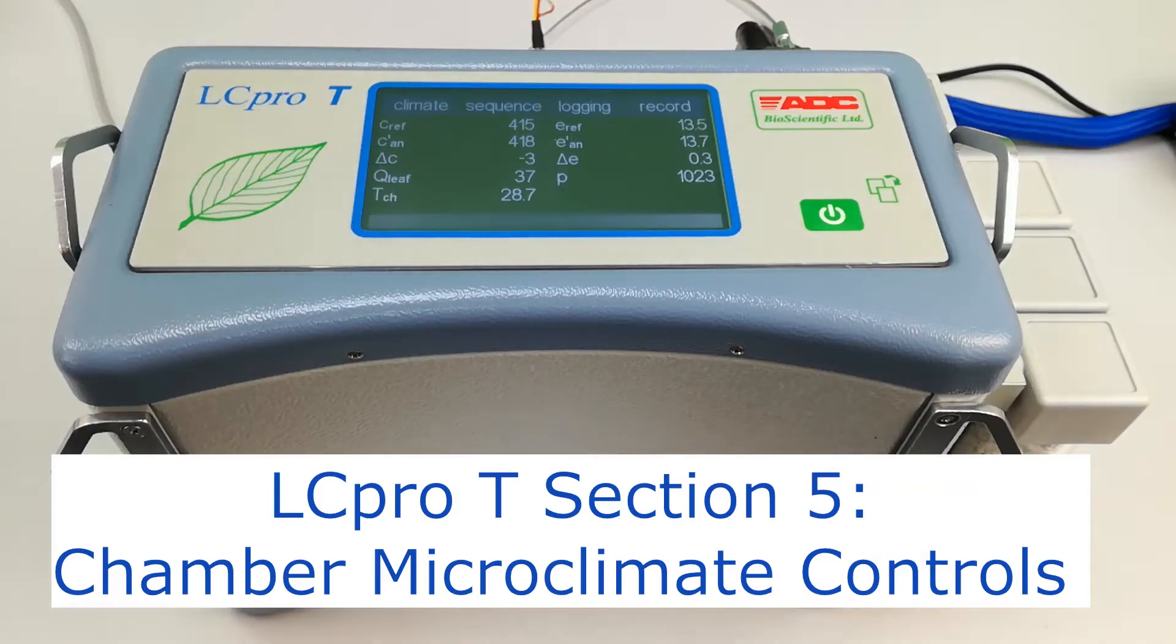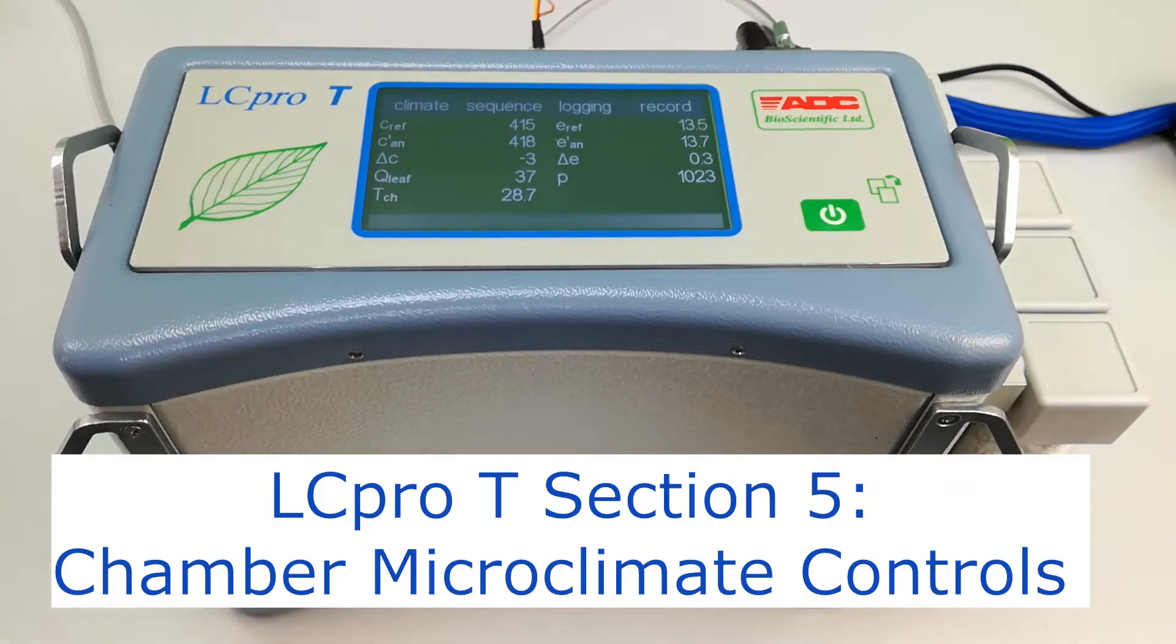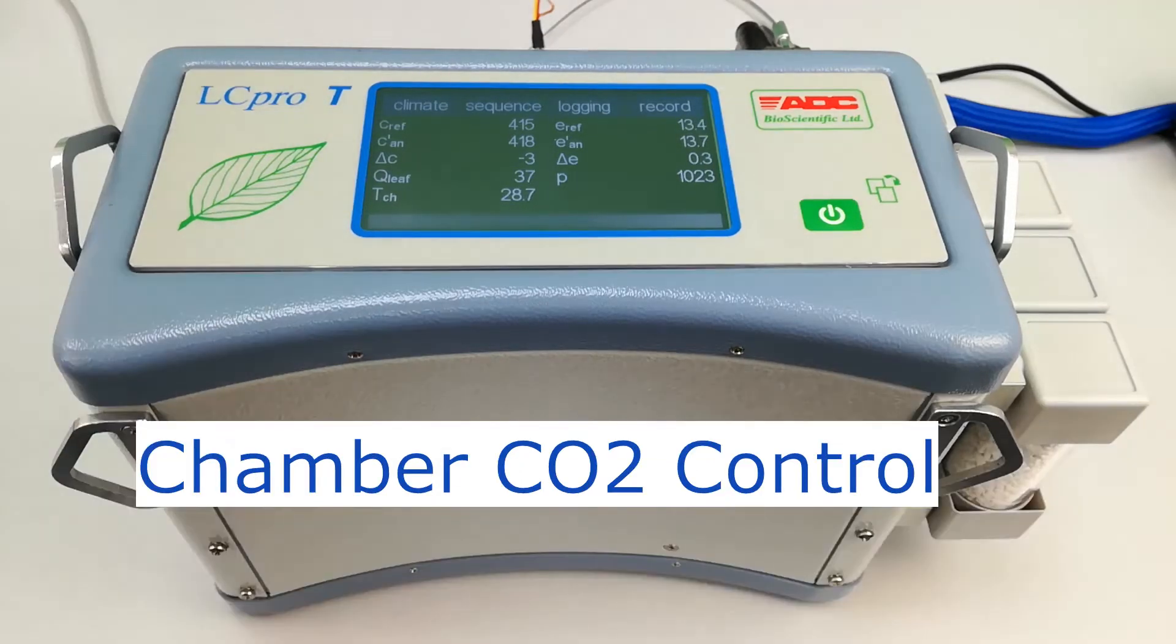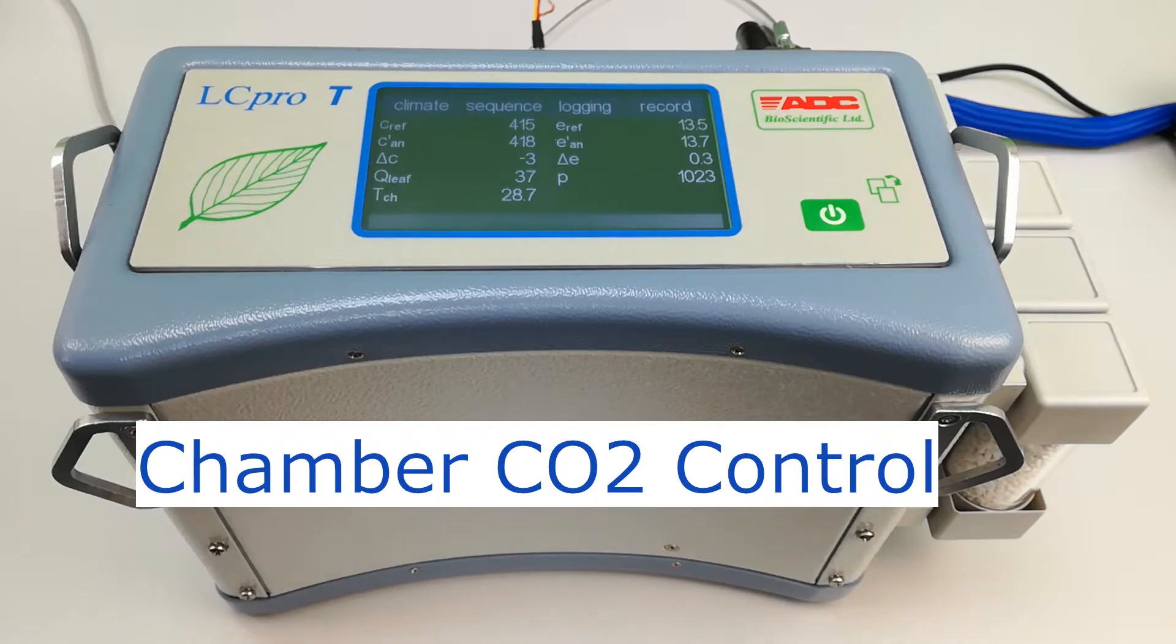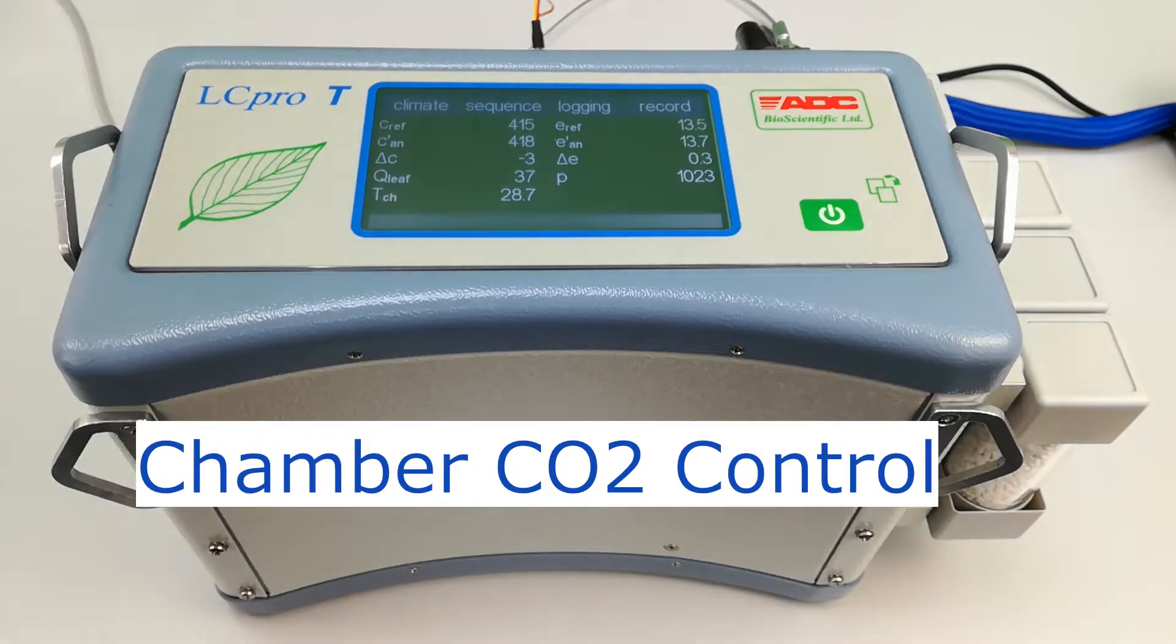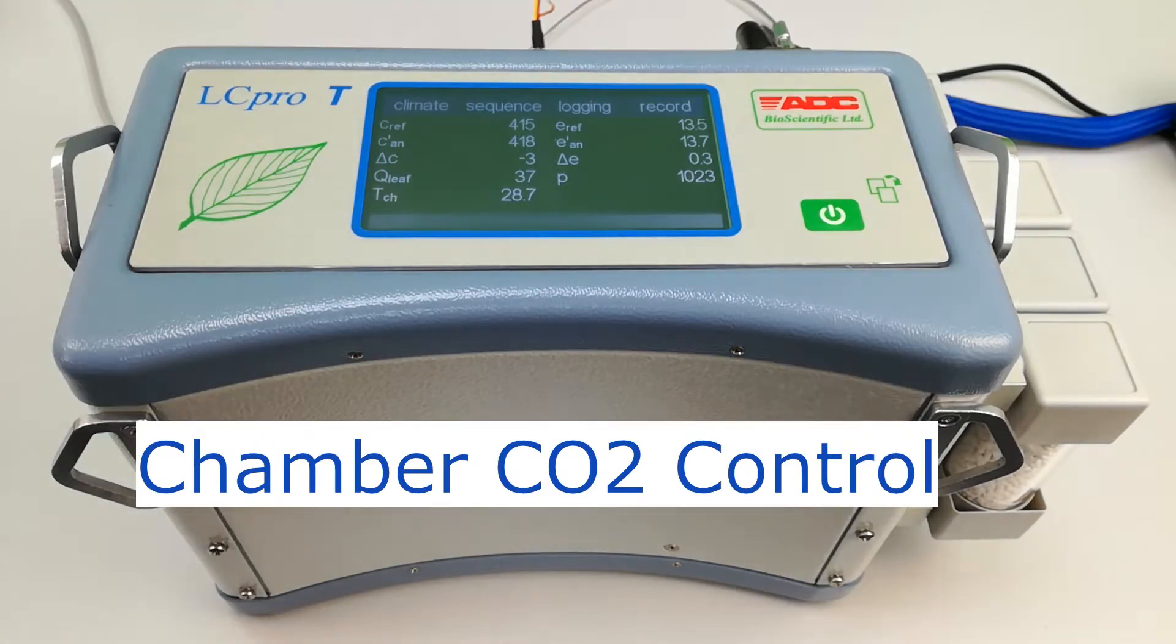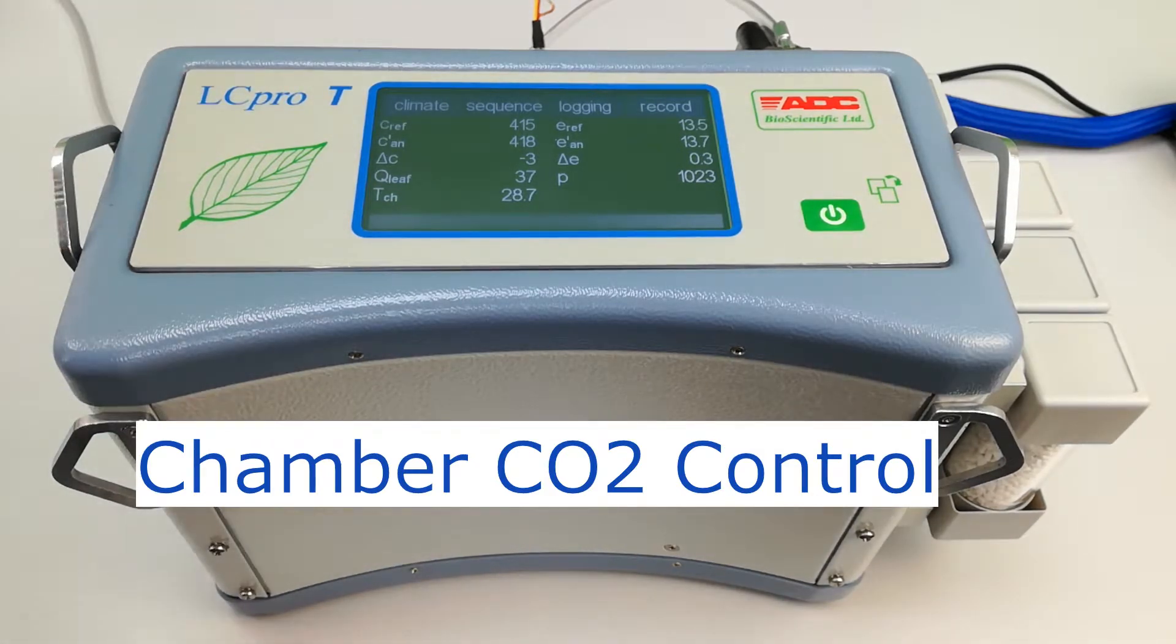Section 5. Chamber microclimate controls. Chamber CO2 concentration is controlled using an installed CO2 cartridge.